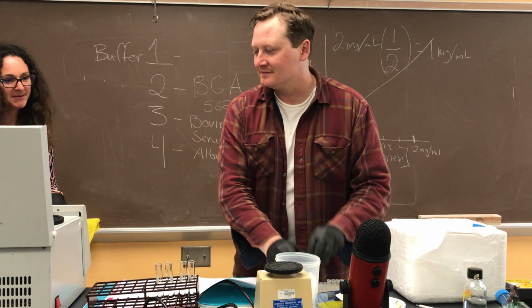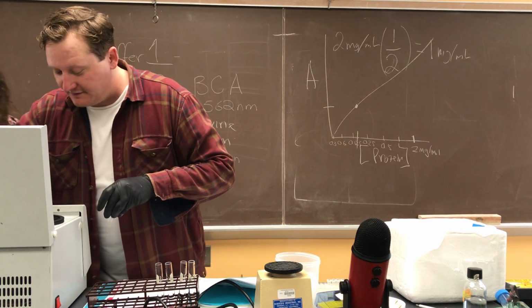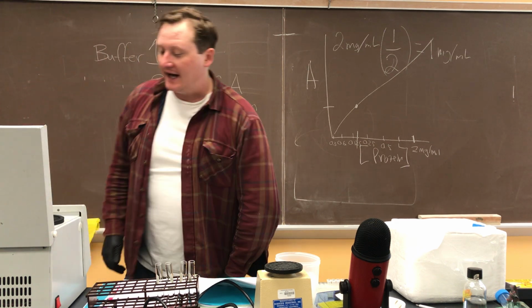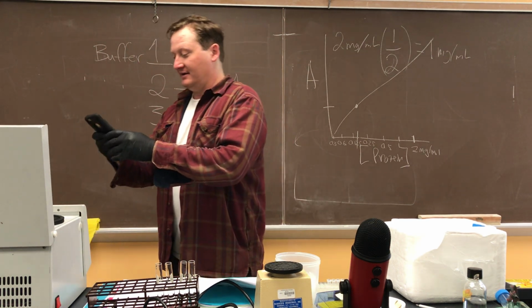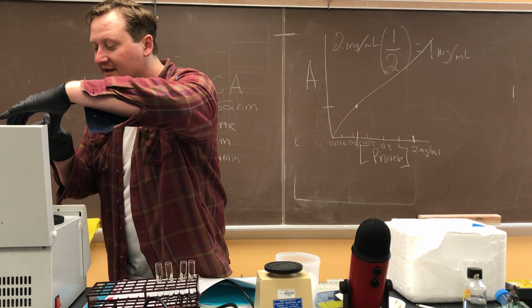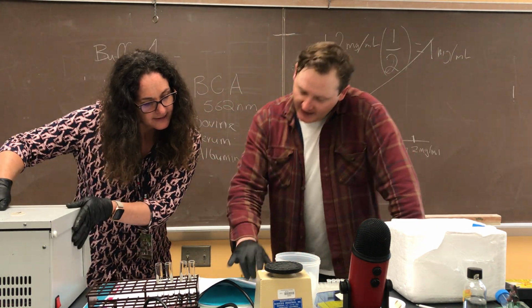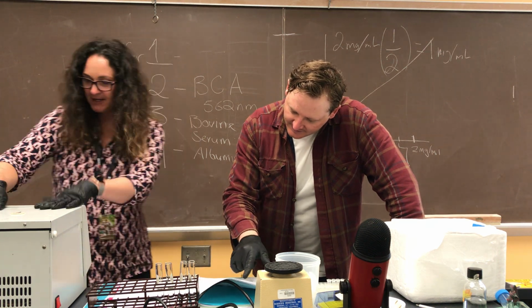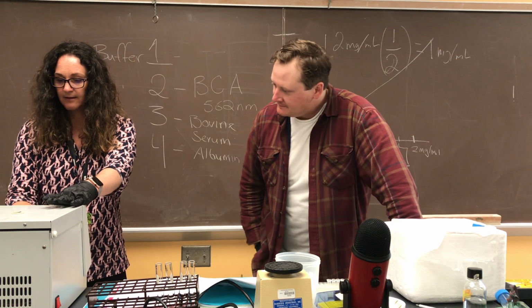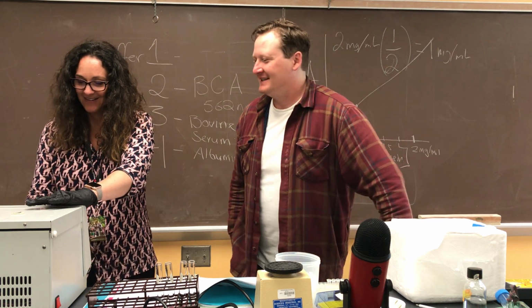Alright, so we're going to pop them in the centrifuge. We'll drop them right in here. It's always important to balance your centrifuge, otherwise you can get some wobble on it. I will take a quick picture, actually. Awesome. Want to make sure that we have all the information for you so you can see what this looks like. Alright, and so what do we need to spin it at? Maximum speed for 3 minutes. Oh yeah, these ones have rough lids. Nice.